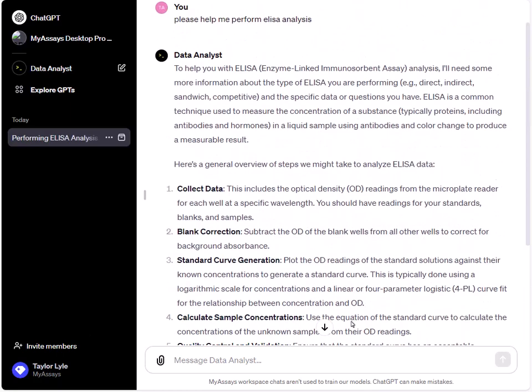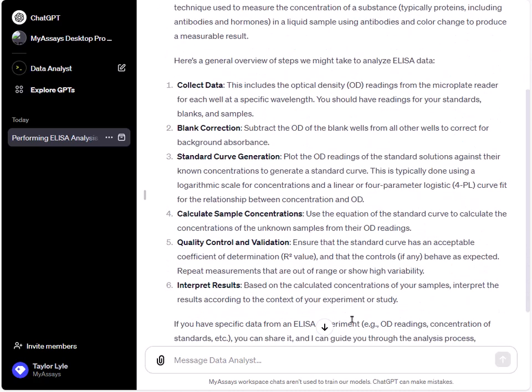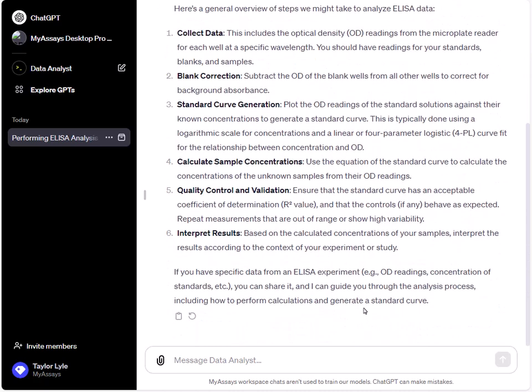We'll receive a response from ChatGPT requesting additional information such as the type of ELISA, data format, standards information, samples information, and the objective of our analysis. ChatGPT will also request our measurement data.